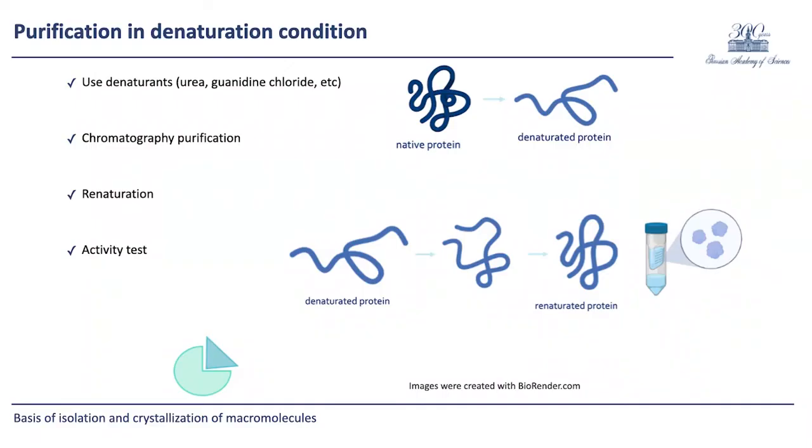What else did I want to tell in the context of protein purification? Let's go back a little bit. After the destruction of the cells, when we have realized that our target protein is in an insoluble form, we can try to isolate the protein from the debris. I'll tell you what to do with such an insoluble protein. First of all, treat the cellular debris with a denaturing agent, urea. Urea helps the target protein to unfold and pass into a soluble form.